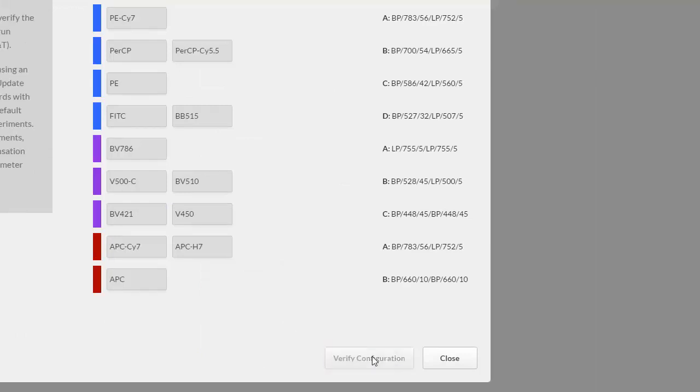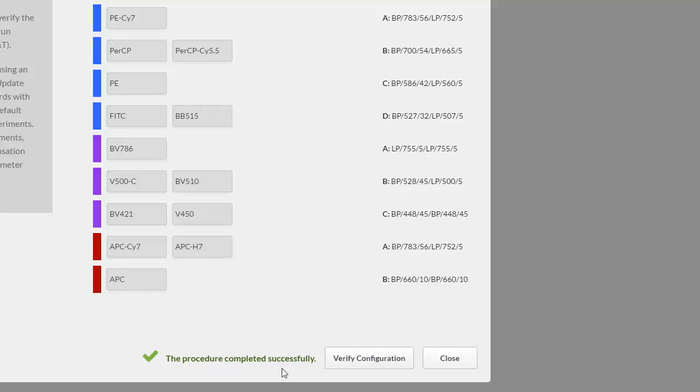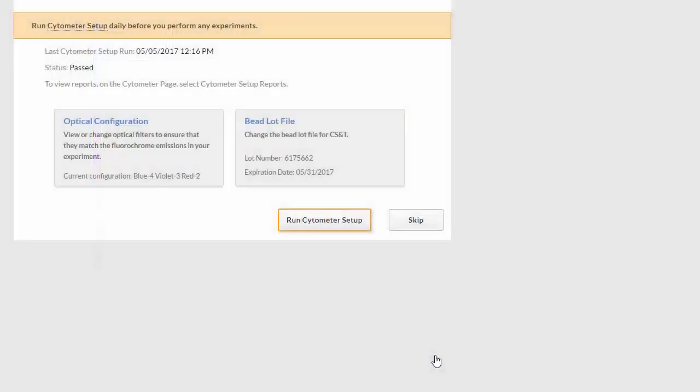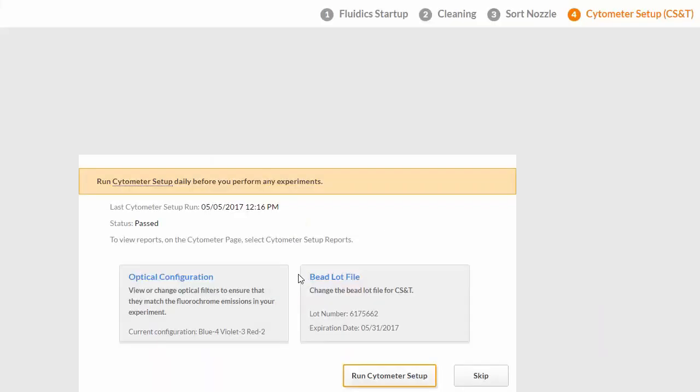Even though we didn't make any changes to the configuration, it is OK to still verify before we close. Verify the bead lot number and expiration date, or click Change to enter new information.